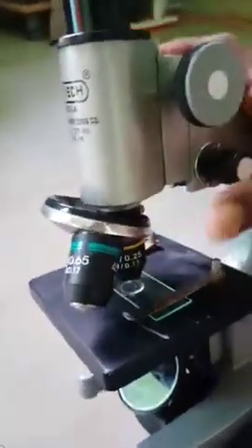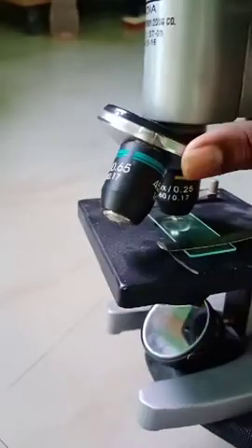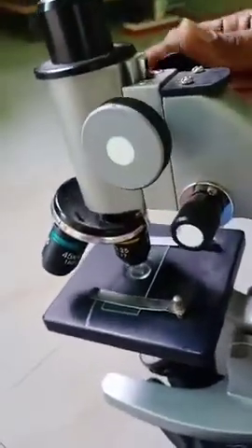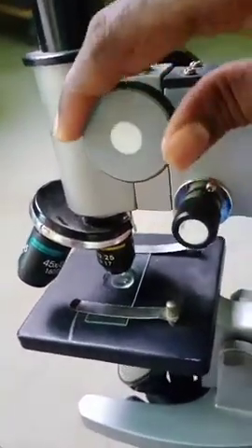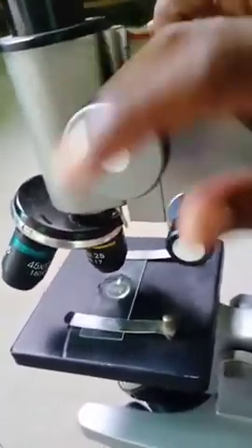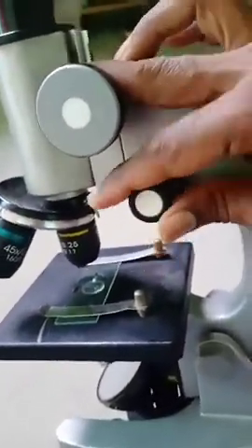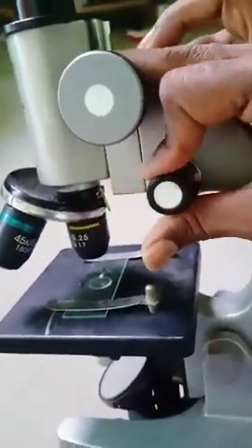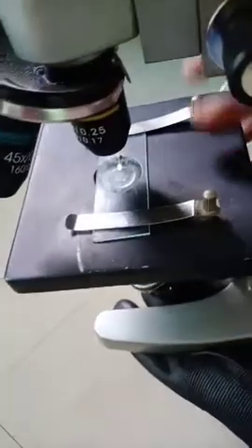Next one, this is the nose piece. At the end of the nose piece we could observe objective lenses. These objective lenses are fixed to the nose piece, and this is adjustable. This is called the coarse adjustment knob. We can adjust the objective lenses, and the one below is known as the fine adjustment knob. We can adjust the contrast and blurred vision of the sample.